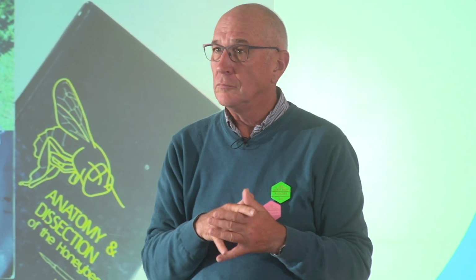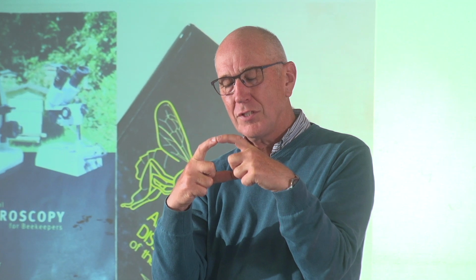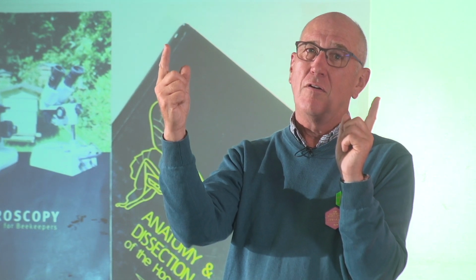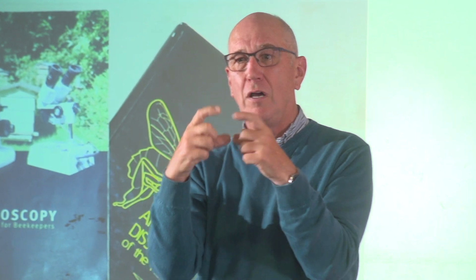And that can also feed into your laptop, so you can see more of a live image. There seems to be a lot of disagreement online as to whether one is supposed to be able to tell the difference between Nosema apis and Nosema ceranae using a microscope. What's your view on that? It is very difficult. Is it possible? Yeah. The ceranae is meant to be rounder and not as long. So you've got 5 to 8 microns for apis, and normally it's about 5 and rounder.